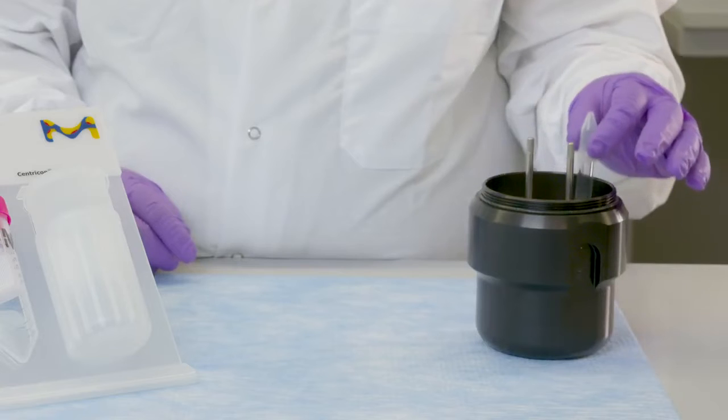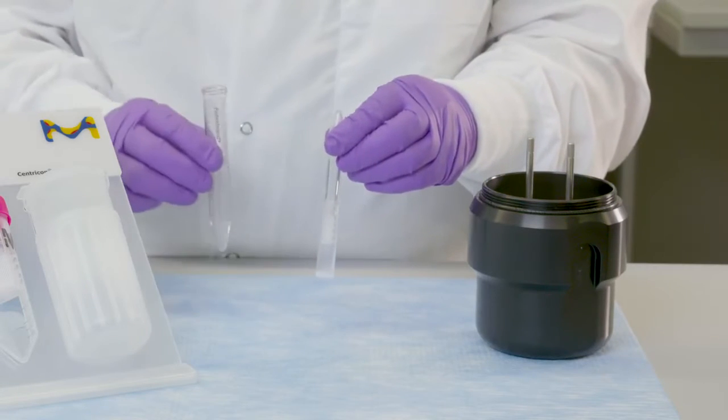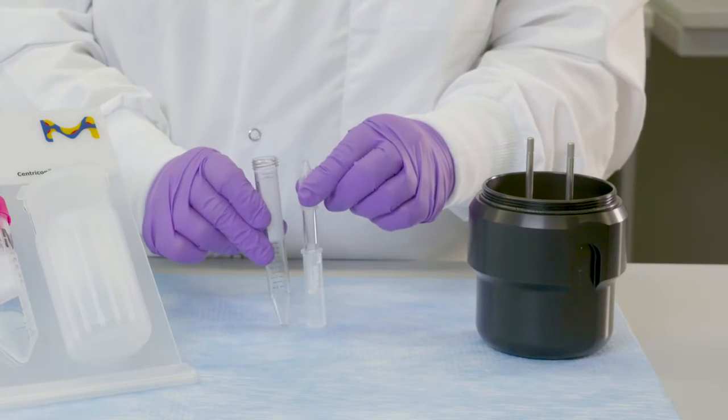This is the same well carrier size as used for the Amicon Ultra 4 devices. The size format is also similar to a standard 15 mil centrifuge tube.